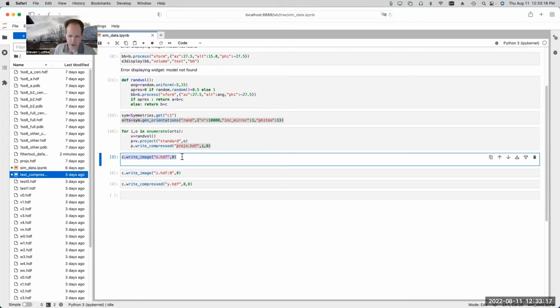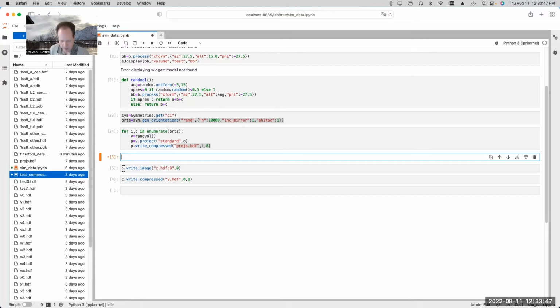If we do a reconstruction, obviously it's going to take a little time for the reconstruction to run. I mean, not days or anything, but it'll take more than the amount of time we're going to be standing here today to run. Maybe that's not a bad thing to do though still. So maybe we should generate some data and I'll reconstruct the data. And then next session, we can load the data that we reconstructed into the dynamics tool. And we've already gone 35 minutes or something. So let's go ahead and do that.